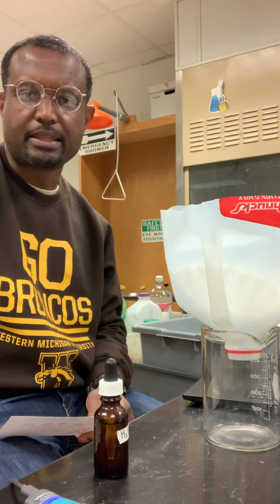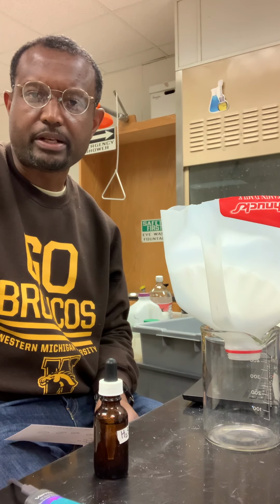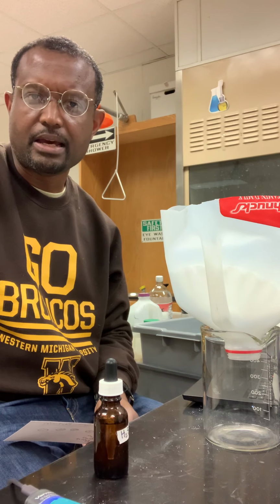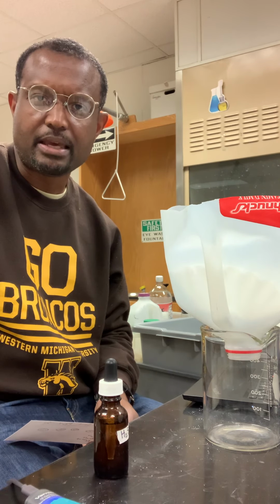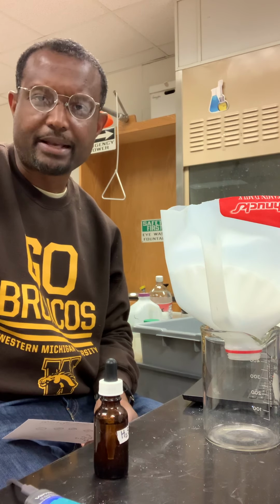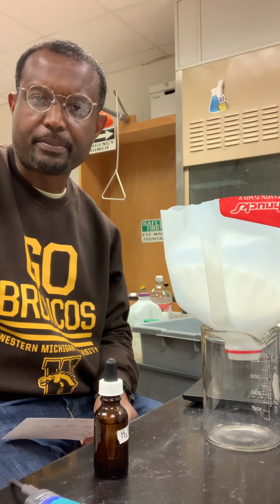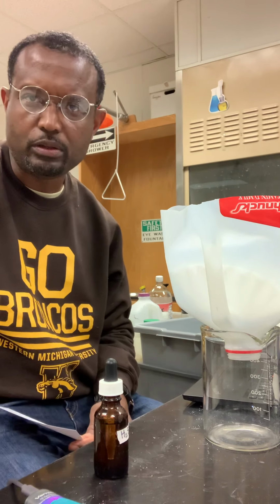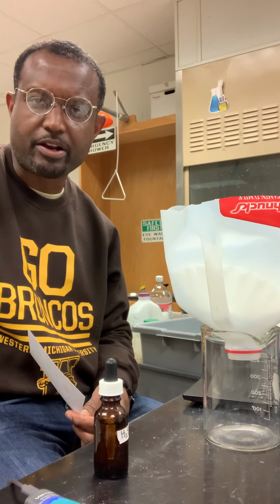Investigation number 3 looks at the impacts of acid rain on soil. Historically, where we've had issues with acid rain, we've seen that forests have been decimated by it, and one of the reasons is that acid rain impacts the soil. And so the soil has a property called cationic exchange capacity. It has the ability to hold on to cations that the plants need as micronutrients.